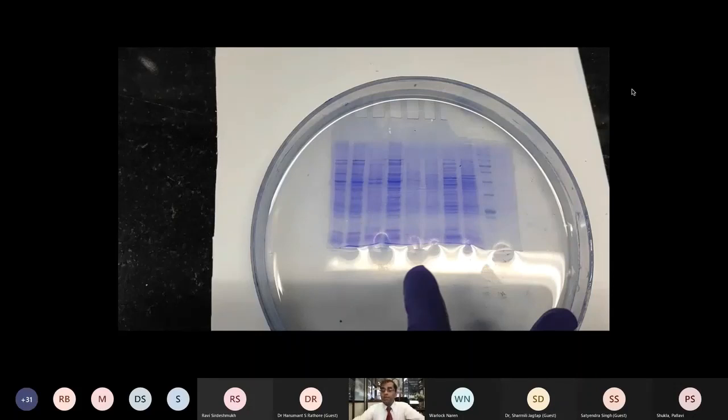But also I would say that many times you're not sure whether your protein may contain some nucleic acid contamination also. So the same protein solution could also be run on the agarose gel, and that is not something which you will normally do. Otherwise, you will only run the nucleic acid on the agarose gel electrophoresis. But if you run the protein sample on agarose gel, and you see there is some smear or some contamination coming from the nucleic acid trace, then you know that this could be what affects the value you see in the quantification. That may not be truly just because of the protein.